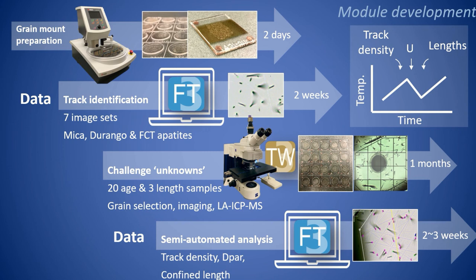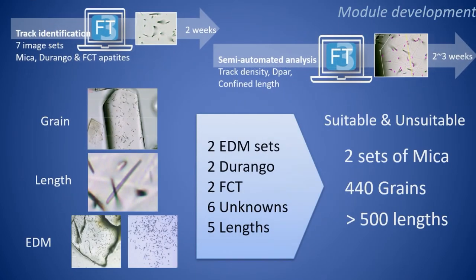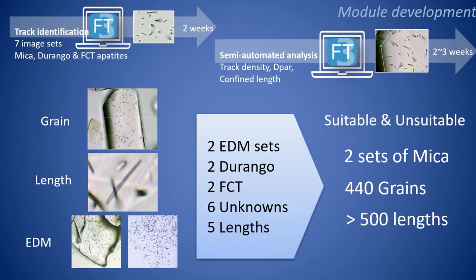Our aim is to use the experience learned from the lab routine to develop an image-based approach to deliver a traditionally labor-intensive training to the analyst's computer. With the digital training module, we have eliminated the equipment-involved steps and put together a package that contains a wealth of images by including a mixture of suitable and unsuitable grains.